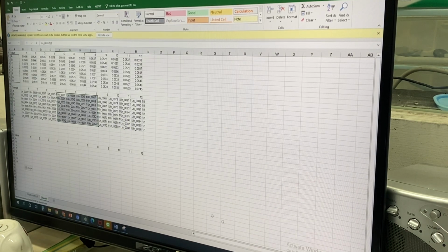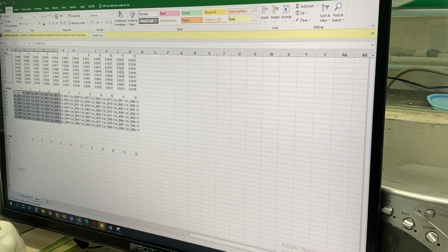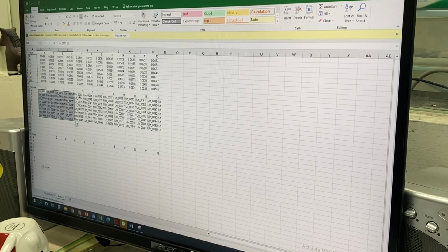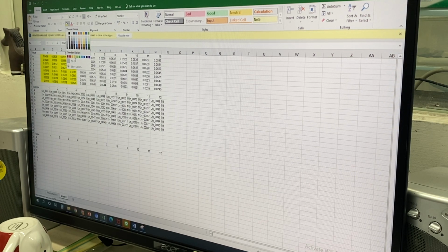Replica is something like copy. Just do 1, 2. This is one replica, okay. I will show the border. This is number two replica, and this is the 3 replica.